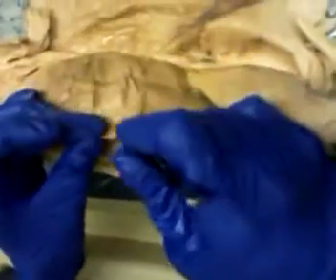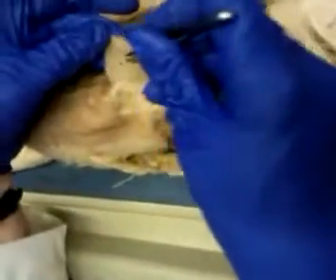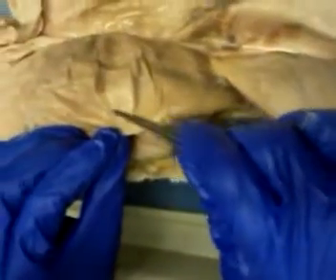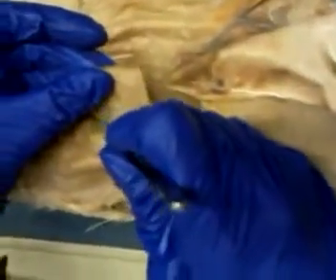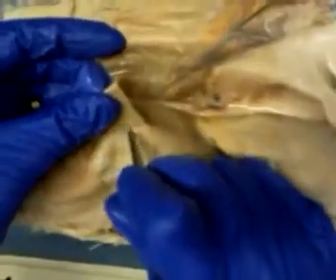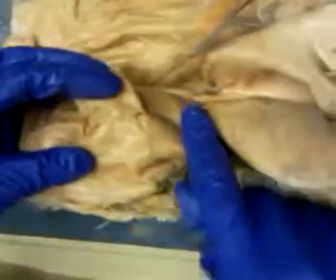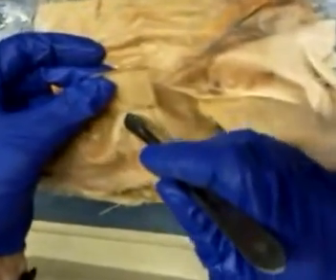Now, fibers going like that. Yes, this is all one layer. The fibers look like they're going lengthwise and descending a little toward the rear, and here they're going lengthwise and descending toward the rear. So I'm convinced when I see inside and outside of that layer, it's all one layer. Now, I said fibers go a different direction in the next layer, and sure enough, these are going this way, and these are going like that, almost at right angles to the layer that I've taken off.